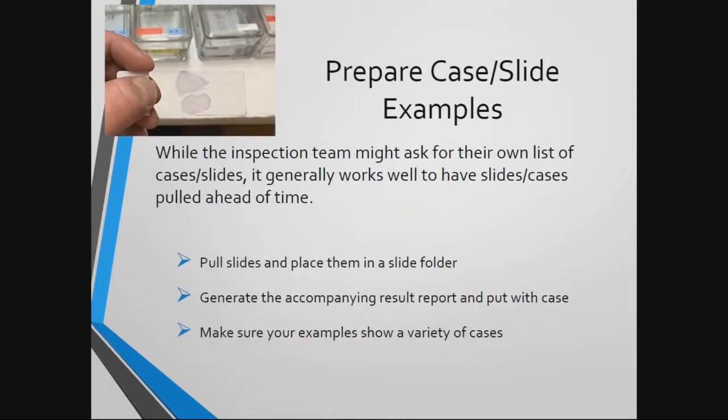Preparing case material ahead of time has always been a constructive method of organizing myself for an upcoming inspection. An inspection team might also ask for their own list of cases and slides. However, I have always found it beneficial to have cases and their corresponding reports pulled ahead of time, both for histology and cytology. Generally, I will pull the slides and put them in a folder and then generate the report and place that with the case. It is most helpful to have a wide variety of cases covering many of the requirements stated in the checklist. The next slide will outline some of the case types I generally have set aside.